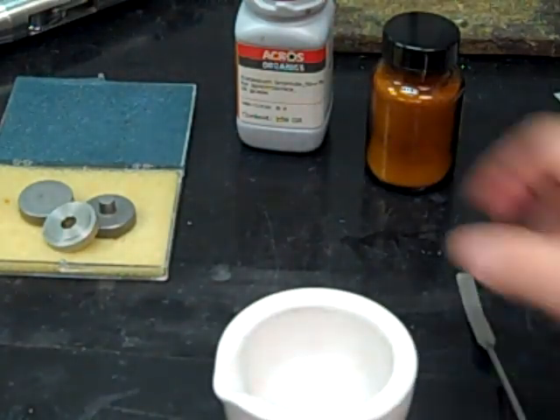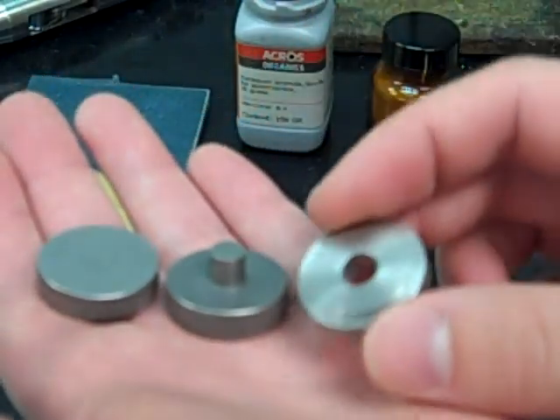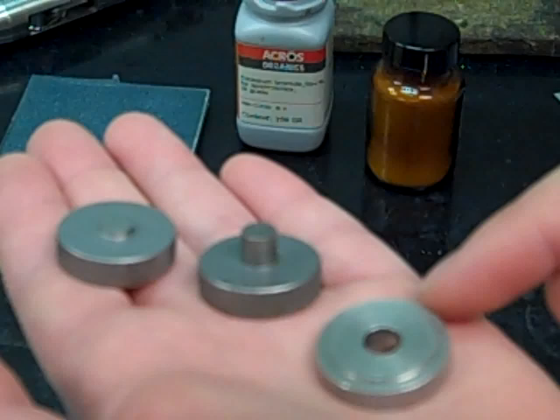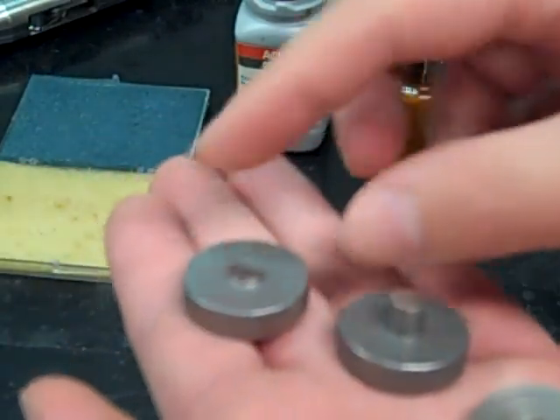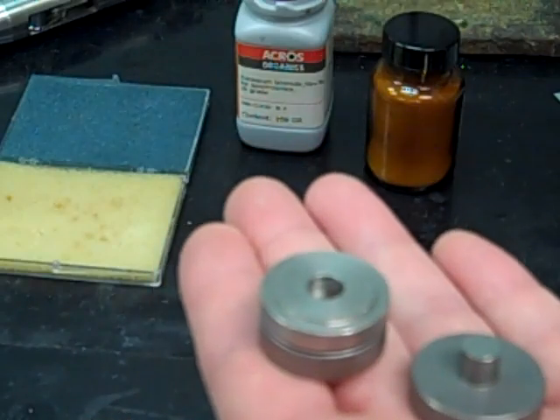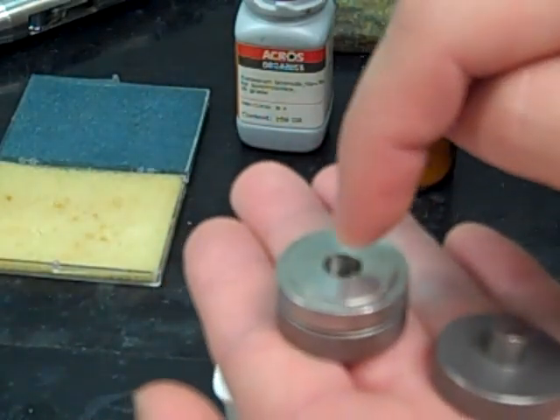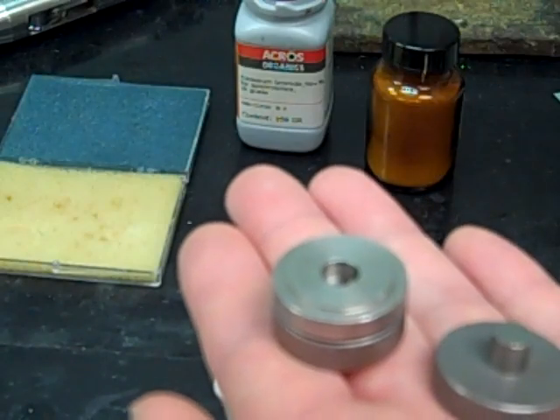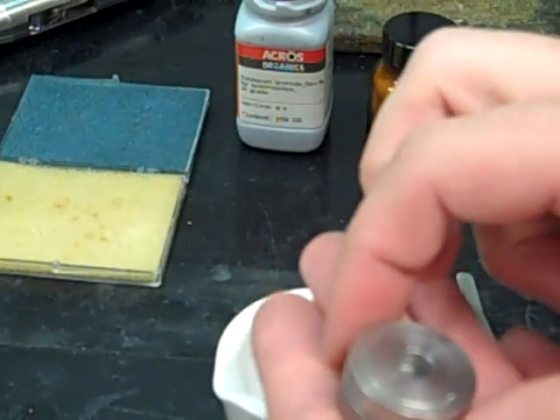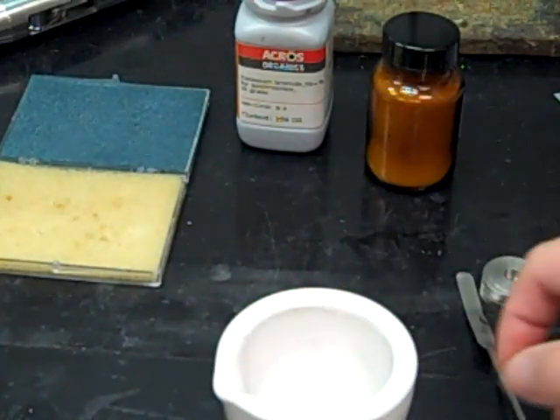So next, we're going to take the 3 pieces of our pellet press. If you remember, we had the short bolt, the large bolt, and then the donut. So you're going to take the short bolt, and the donut will slide right on top of that. And this is actually where you're going to put your solid sample to be pressed into the pellet. So with this, I'm just going to set it down here on the bench.